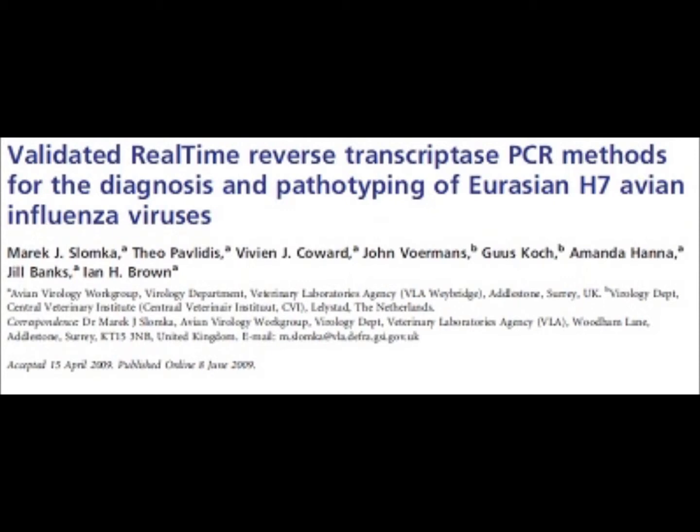But in general, the culture techniques are slow because you have to grow the virus to a certain level before you can actually detect it by looking at what's called cytopathic effects or by looking at staining with antibody. In case of the RNA, it's detectable earlier, and because the PCR techniques are so sensitive that they can detect in the 5 to 10 molecule range, it becomes a lot faster to detect these things and get a much earlier result than what you'd get with traditional culture methods.